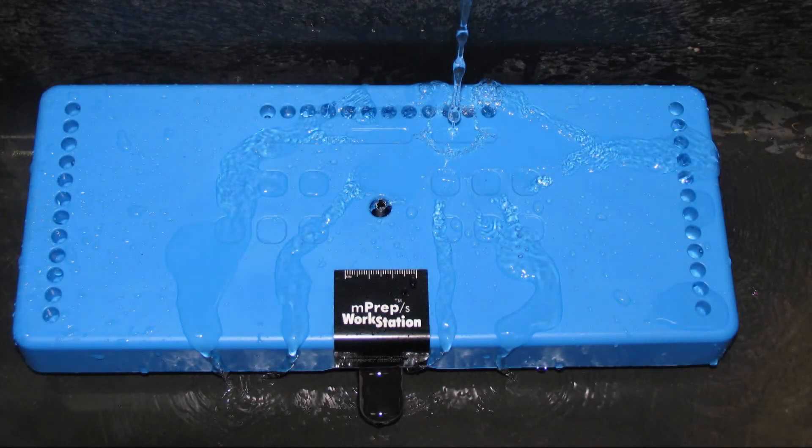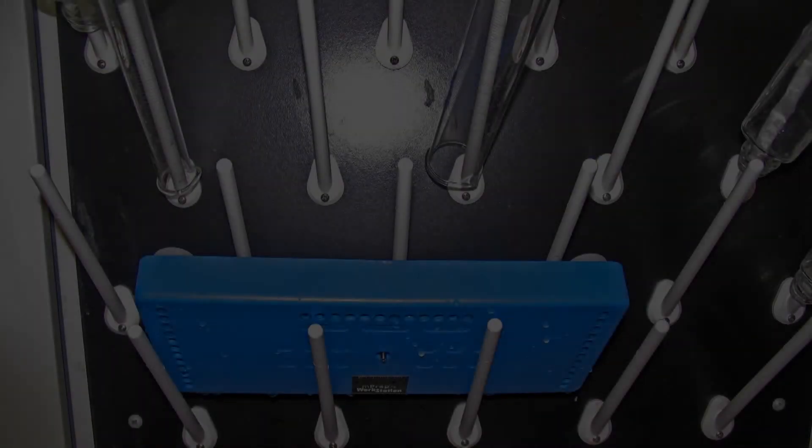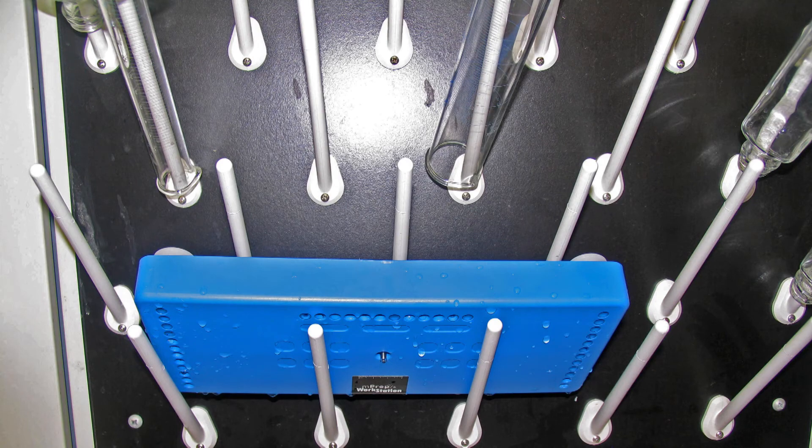After use, the MPREP workstation is easily washed by placing it under running water. Note that the spreading rod should be removed so it won't be lost. After washing, the workstation can be dried on a rack.